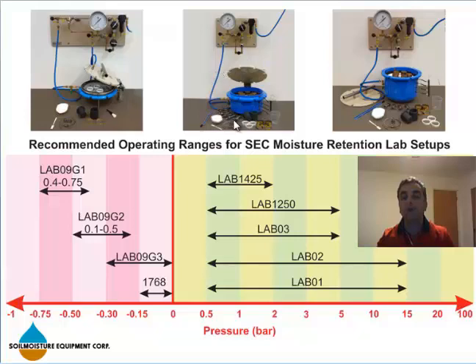So you can run 48 samples at one shot, which is a great number, and it is unique between any competing method, basically. That is why all commercial soil physics labs use our lab equipment, because it's a method that is very good for large quantities.